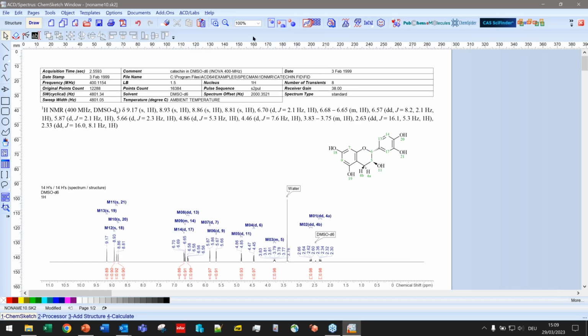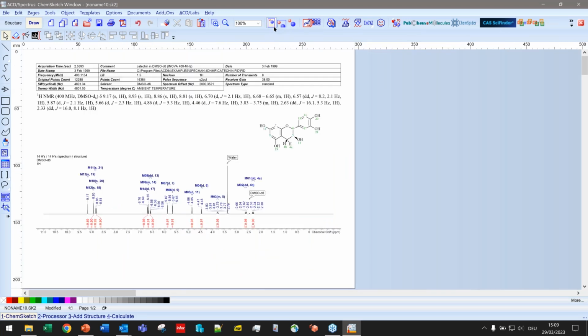The ChemSketch window is going to open because the report is generated in ChemSketch, so that's the reporting editor. And the important buttons are actually the zoom buttons when you work with reports. So we can use the full page button to display the entire reporting page. You can see at the bottom that there are two pages to this report. So we're looking at page 1 out of 2. If you want to navigate to the other page, just click the button next to it.